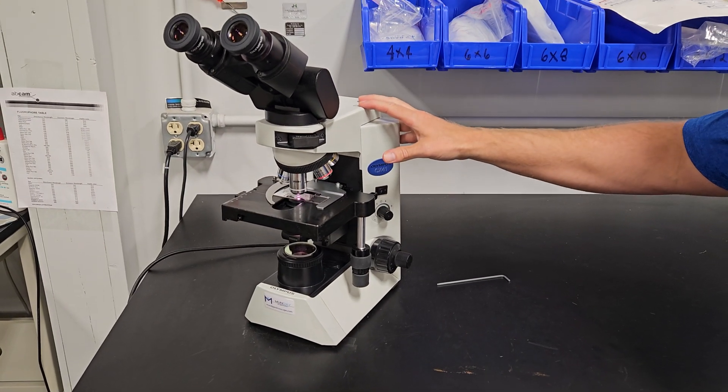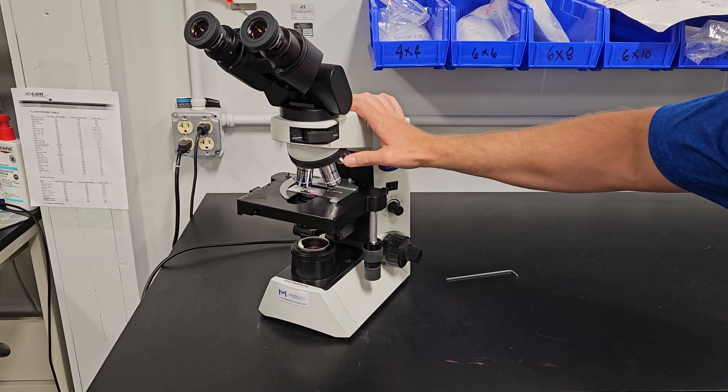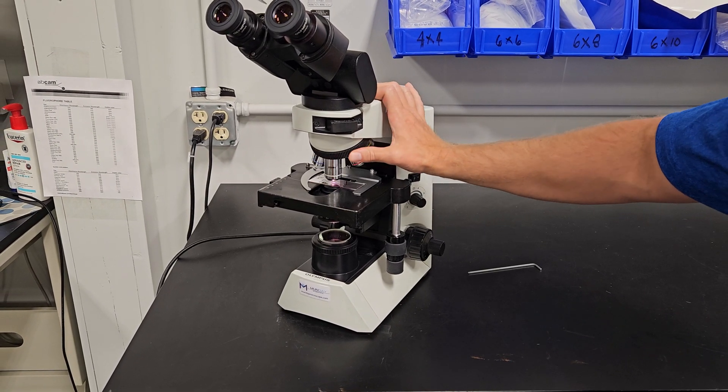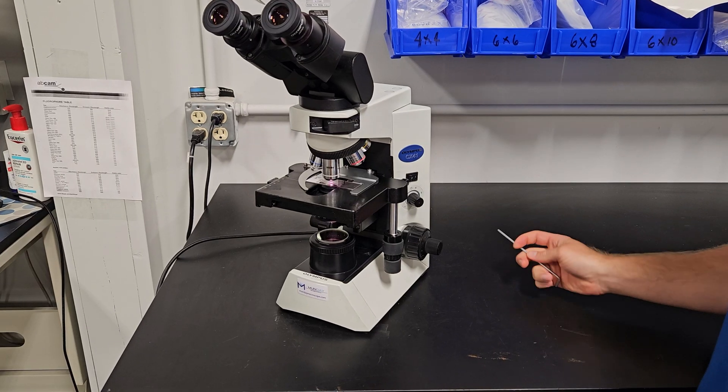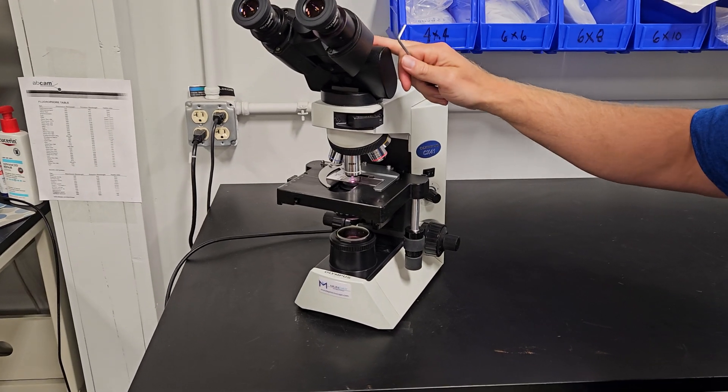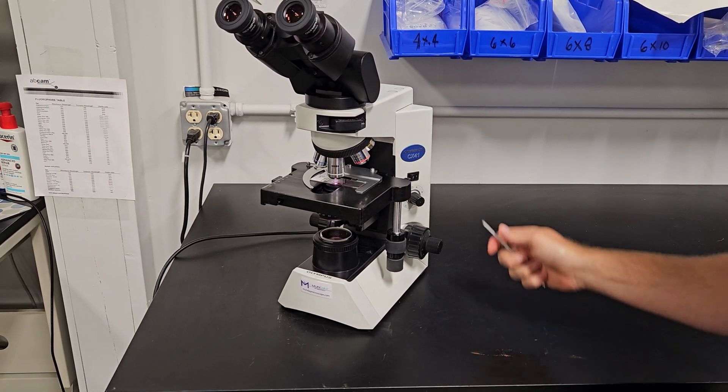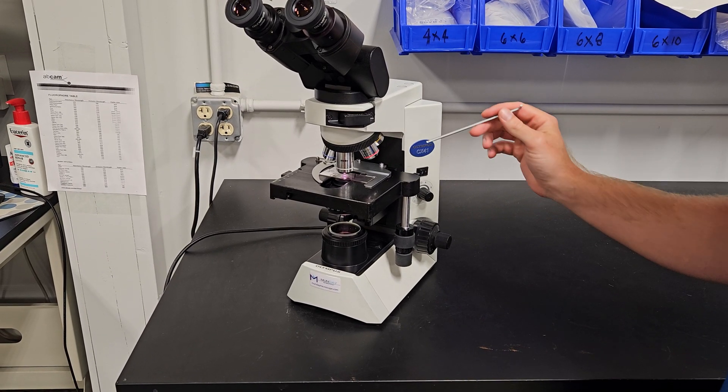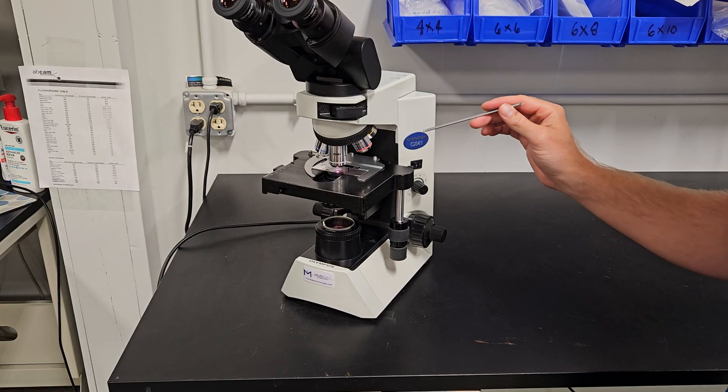This one's set up for pathology use and it's going to a pneumo surgeon I think in Minnesota. We're just going to go over it really quick. They wanted to keep their ergonomics and meet their budget. Their budget was $3,500 or less. We were able to meet the budget and come in below the budget.